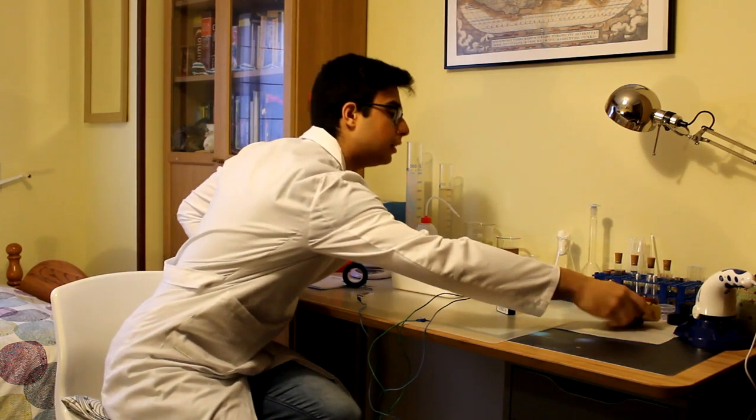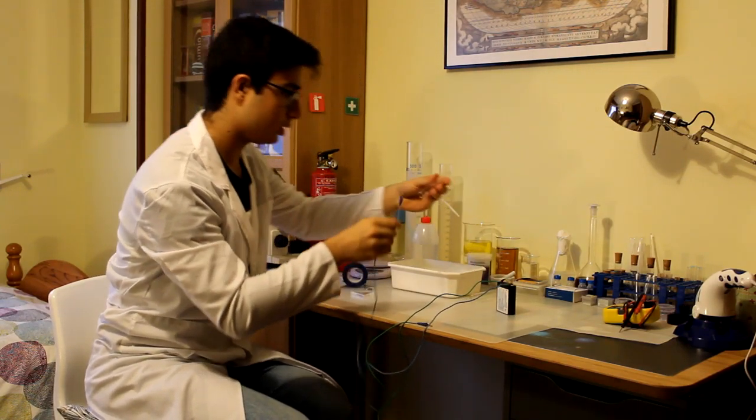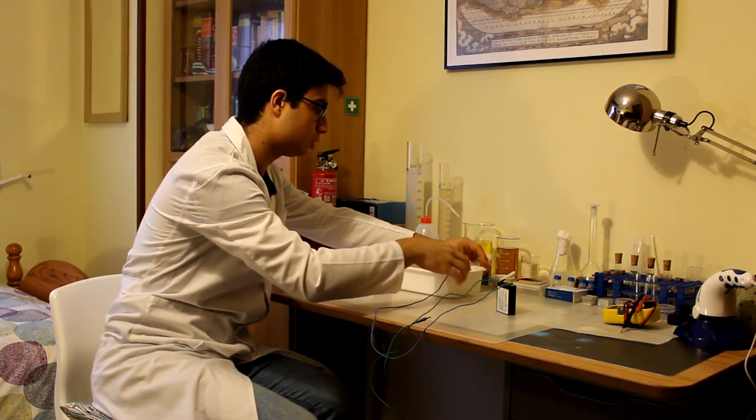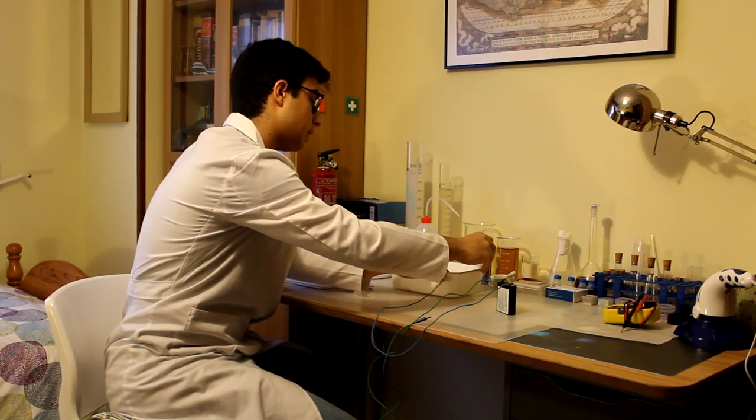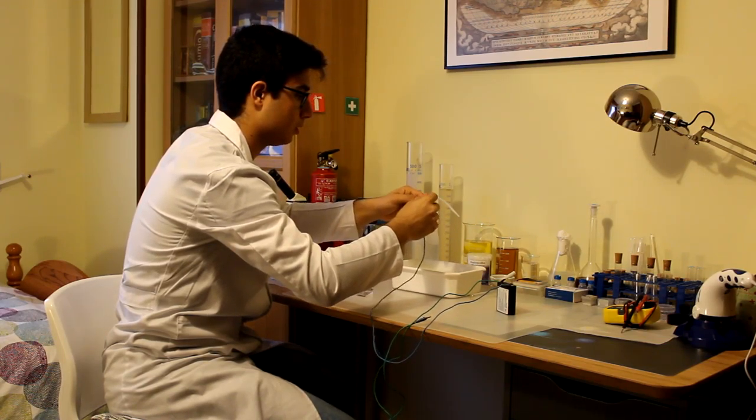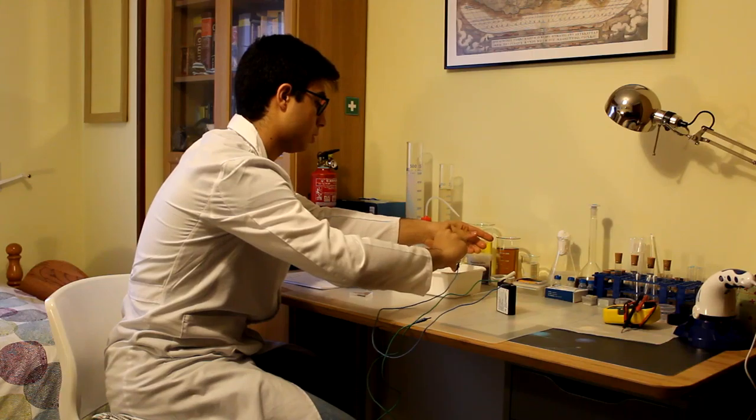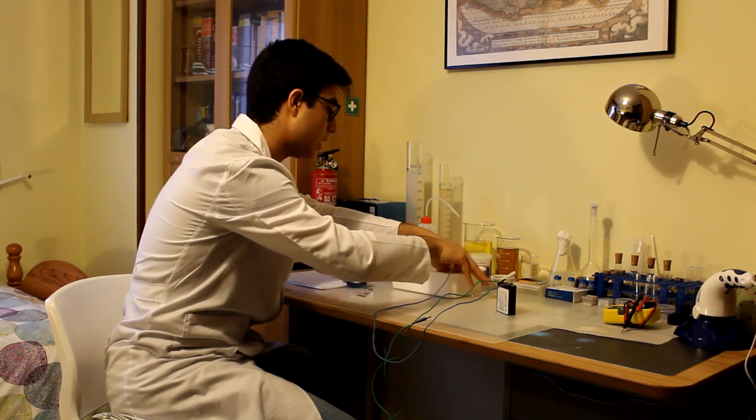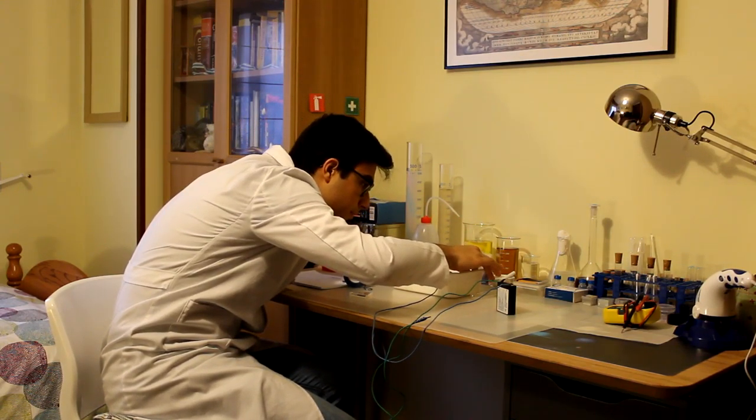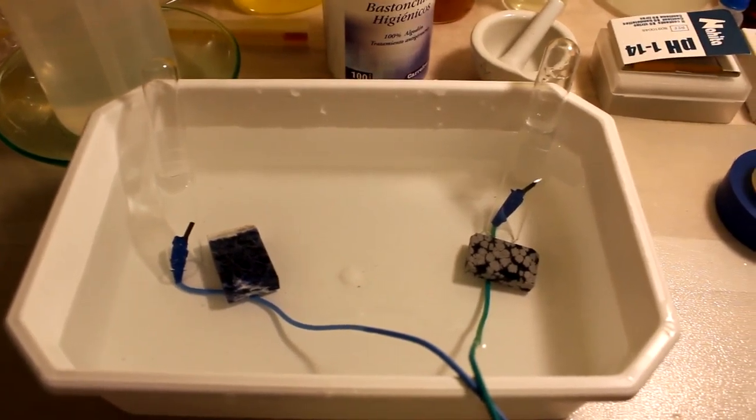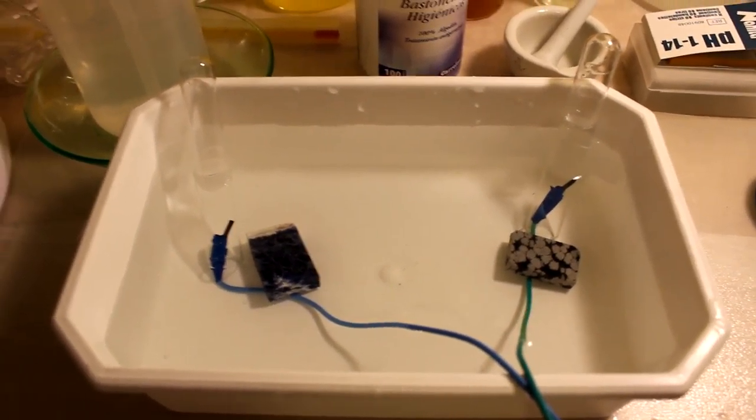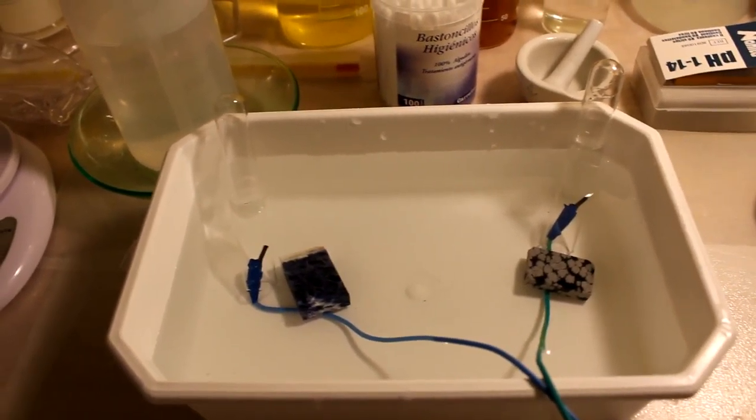Vale. Y ahora cogemos el tubo de ensayo y lo colocamos en la cubeta de tal manera que el grafito esté completamente sumergido. Ya lo he terminado. Lo que he hecho ha sido ponerle un poco de peso a los cables para que se estén bien sujetos y no se muevan. Y ahora voy a explicar lo que va a pasar de aquí a unos minutos.